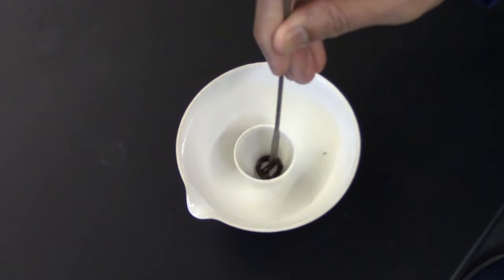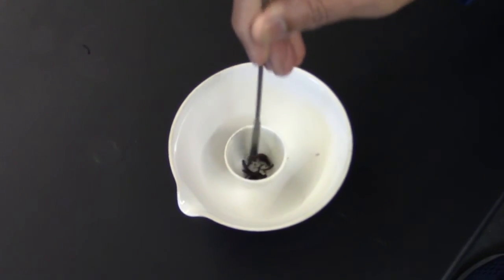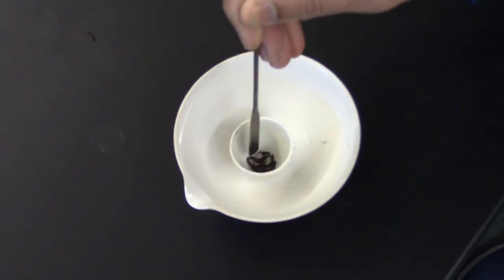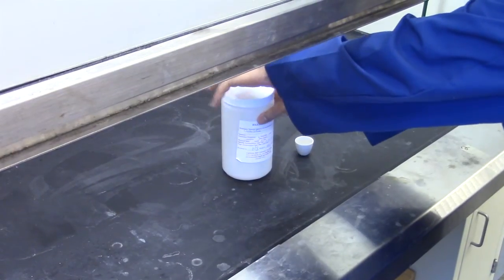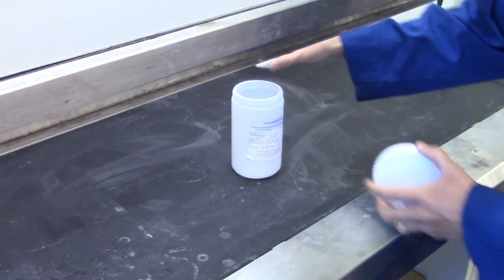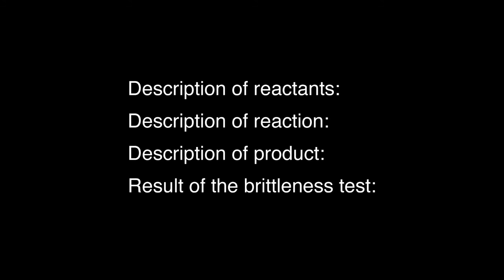When complete, perform the brittleness test on the product. Take a metal spatula and try to break the product. After completing the test, put the product in the waste jar. Your observations should include the following: description of reactants, description of reaction, description of product, and the result of the brittleness test.